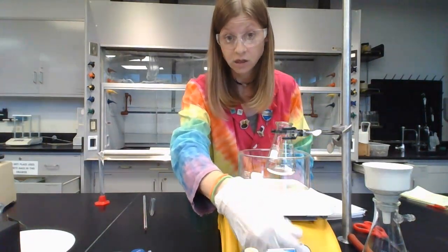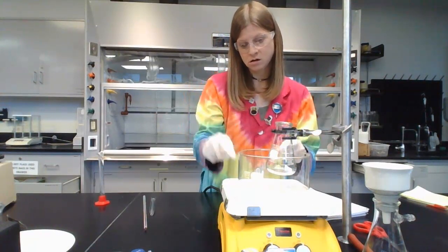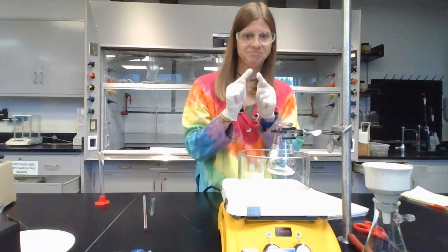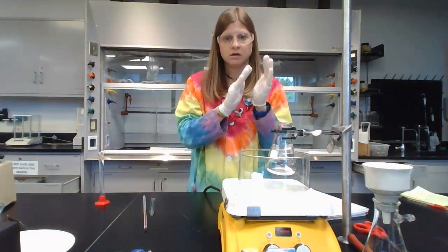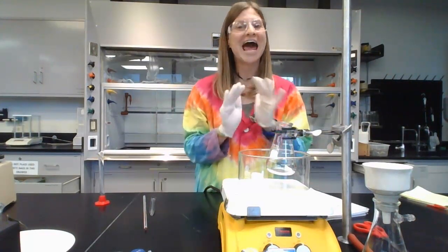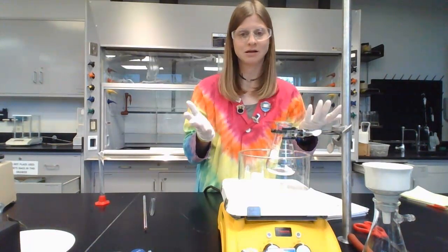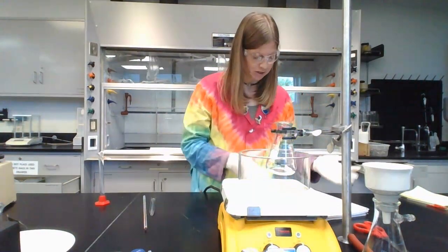because we need that stir bar to mix, but the stir bar is floating up here, the stir function's down there. So what's going to happen is the stir bar is not going to be nice and fluid and smooth as it normally is. It's going to kind of jump, wiggle, stop, think about its life. Wiggle a little bit more, jump, think, stop. So as long as it's moving at all, even if there are pauses, it's agitating liquid, that's all we need. So it's not going to be spin, spin, spin, nice, happy, perfect. There might be some clinking because it's going to run against the glass. Again, there's a gap between the magnets, so it's not going to be perfect.